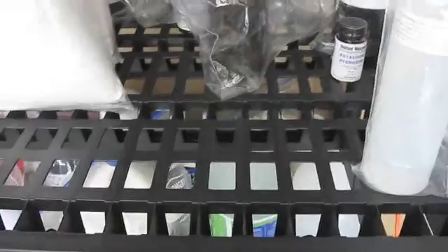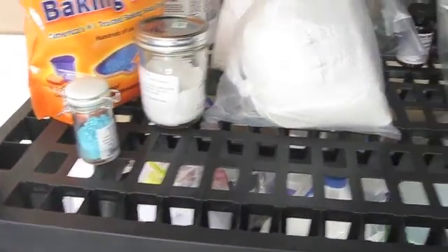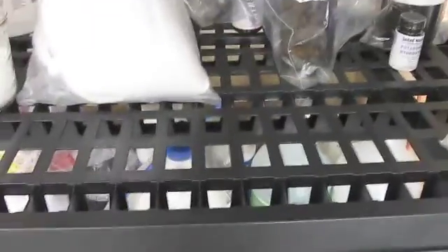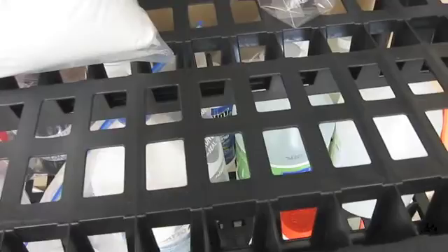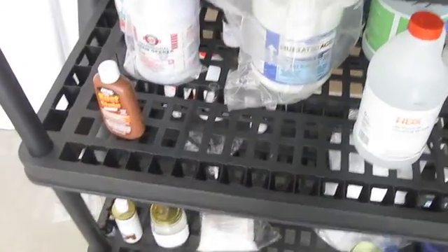With this shelving, I'm thinking about putting some cardboard down just so that if there is any spill, it doesn't leak onto the shelves below it. Another reason to put cardboard is to store vials and things, because if I just put a vial in here, you can see it doesn't work. But you can store vials on these shelves — in fact, you can store them on the border, and you can see it's pretty sturdy.